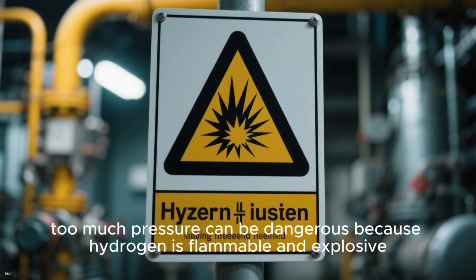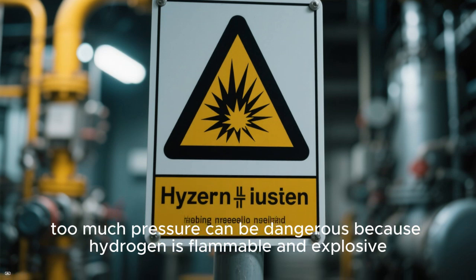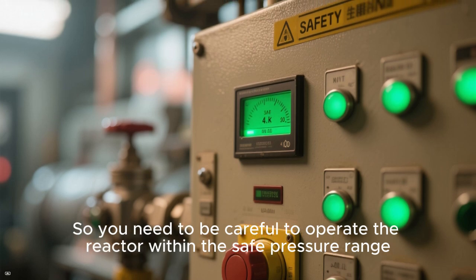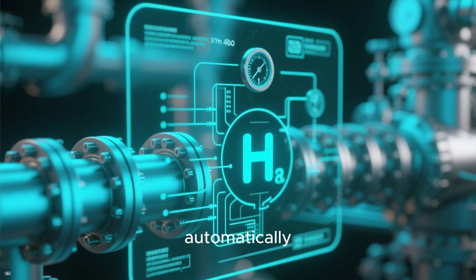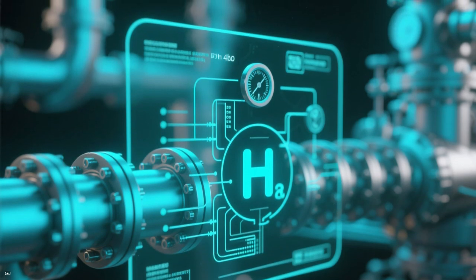However, too much pressure can be dangerous because hydrogen is flammable and explosive. So, you need to be careful to operate the reactor within the safe pressure range. One way to do that is to use a back pressure regulator like this one here. And this will keep the pressure at a constant value by automatically adjusting the flow of hydrogen into the reactor.